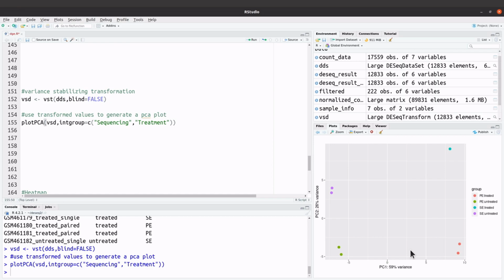When we talk about hidden effects, one hidden effect that we can have is what you call batch effects. In some cases, we can also say these hidden effects are unwanted variation. This has to be taken on a case by case basis.